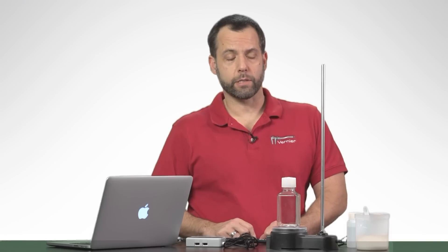I'm John Melville from Vernier Software and Technology. Today I'm going to be talking to you about a really interesting experiment that looks at the metabolism of different types of sugars.